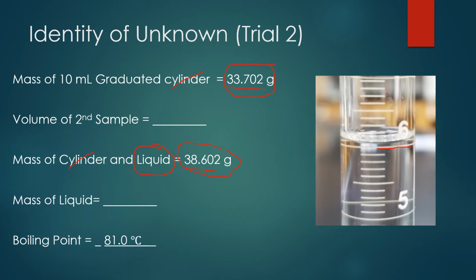We did the boiling point of this one again, this time getting an experimental boiling point of 81.0 degrees Celsius. So you can put that in your table.